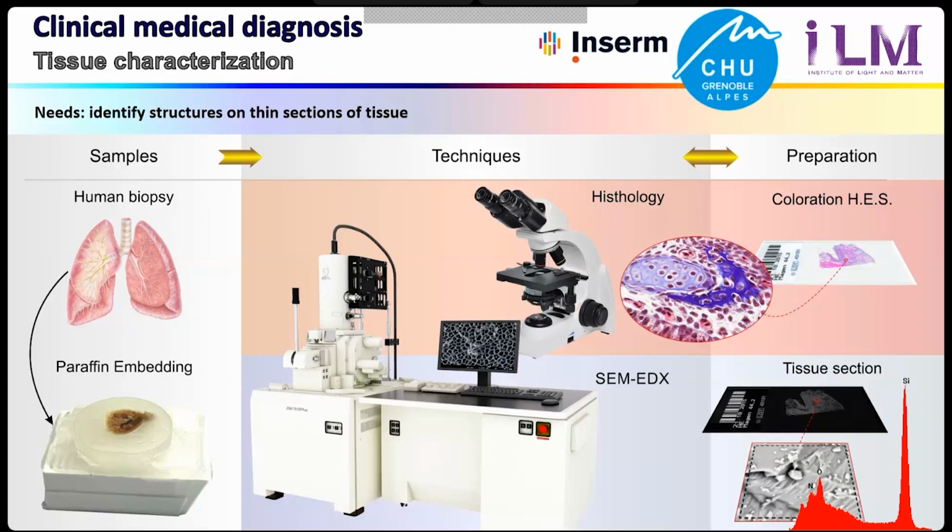In some cases, if the clinicians suspect intoxication with exogenous elements, they can ask for SEM analysis. And so a part of the tissue is sent to a SEM-EDX, and they do some punctual measurements to detect if there are some particles and so on.